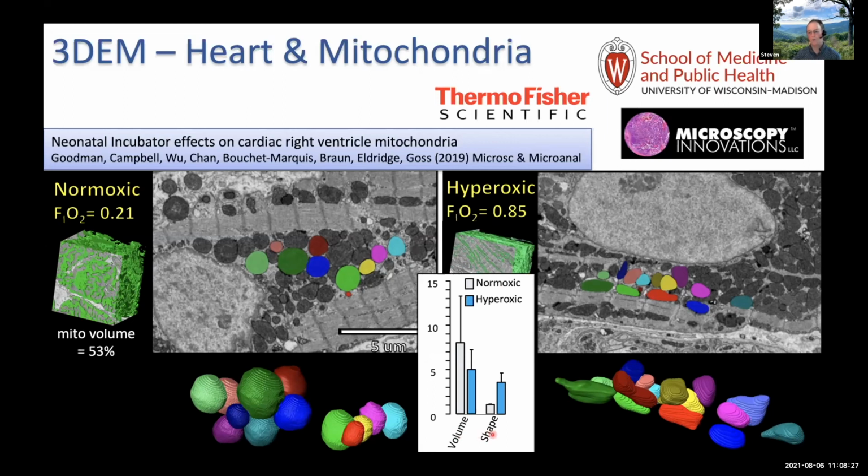Again, the tissue prep was done in just 1 day instead of a standard multi-day manual protocol, thus accelerating the time to knowledge and achieving this with less effort. And again, I want to acknowledge here, all the imaging and image analysis was done by the Thermo Fisher Nanoport facility.